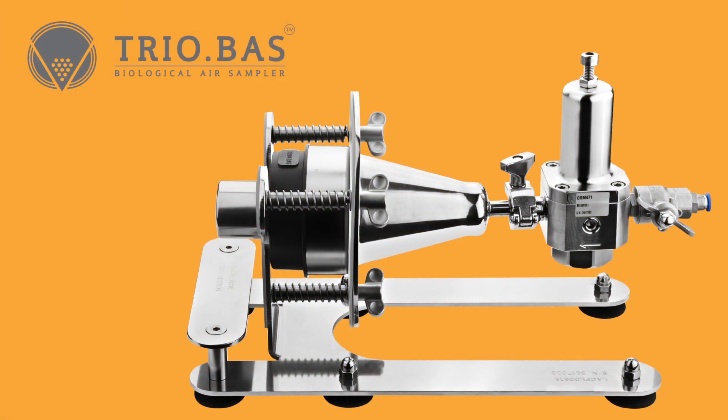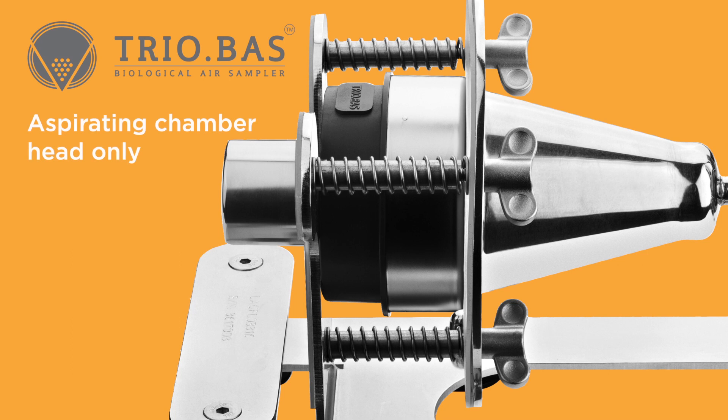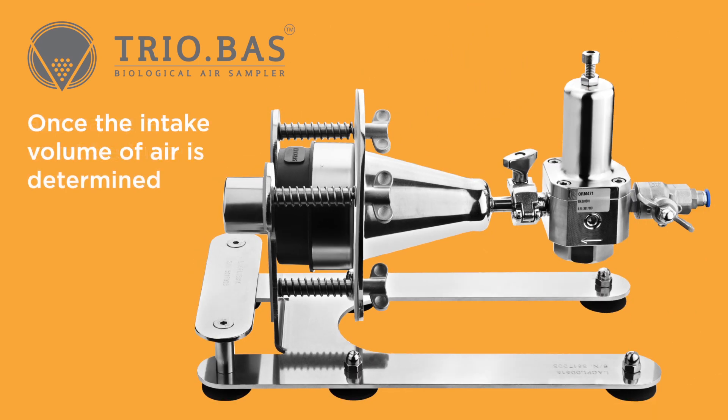The TRIOBOS gas may also be purchased with an aspirating chamber head only. In this instance, data must be manually recorded and samples must be timed. Once the intake volume of air is determined, calculate the minutes required.